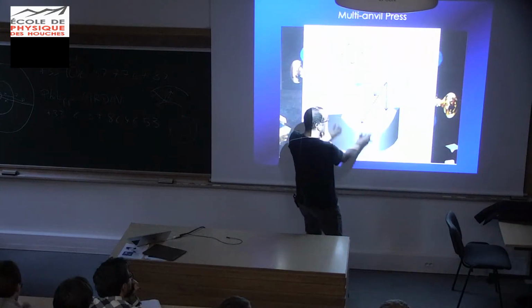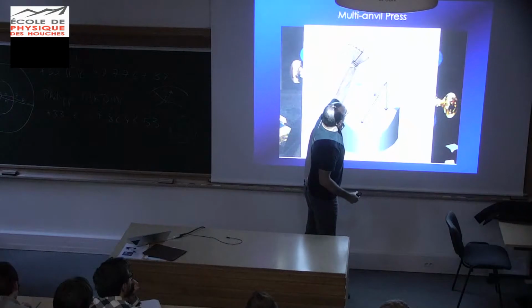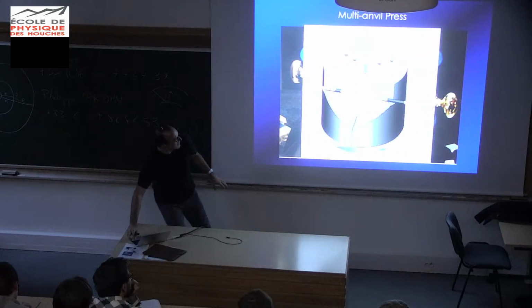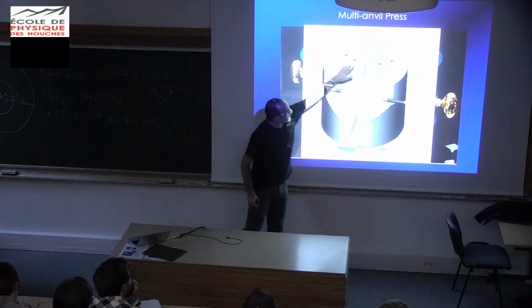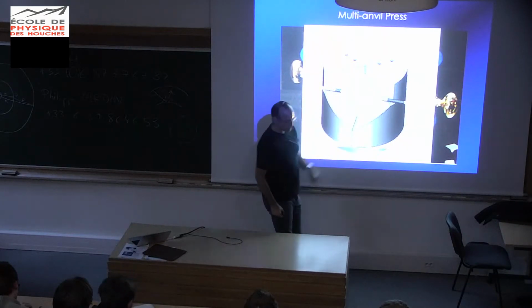And as you push this up, it can move together. It can slide around itself. And you're going to come and put this assembly inside of that, okay? So it falls here, and you put the top primary anvils on top. So you have 6 primary anvils and 8 secondary anvils and your sample assembly in the middle.